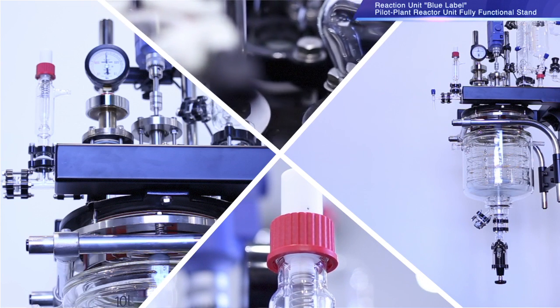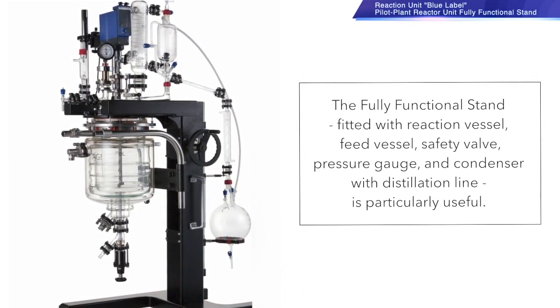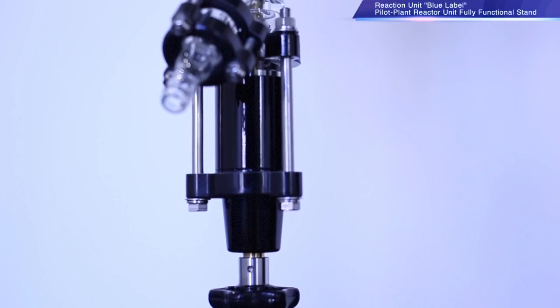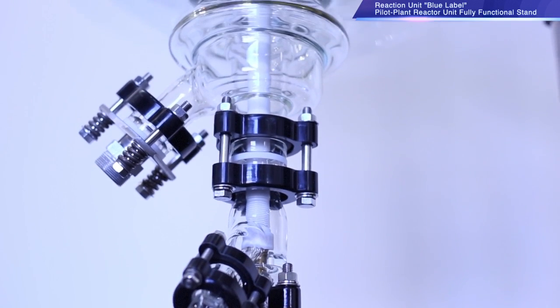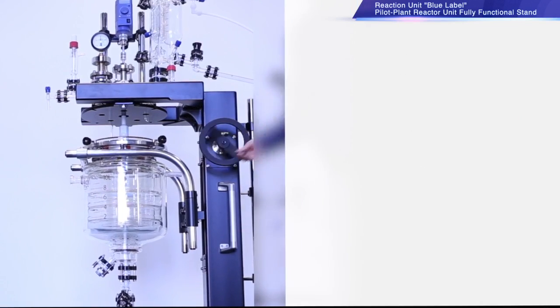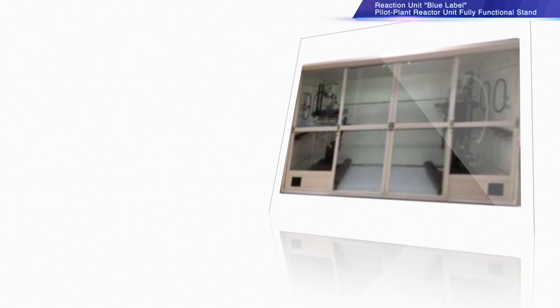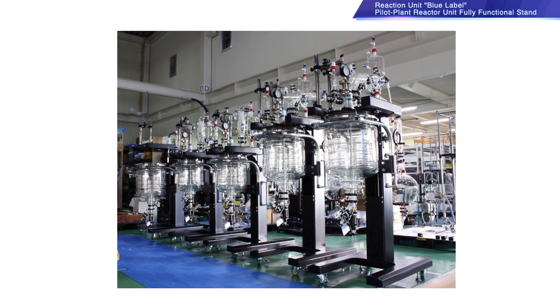This is the Blue Label Pilot Plant Reactor Unit with fully functional stand. 10 litre plus capacity units are fitted into an easily moveable, wheel-installed stand. The fully functional stand is fitted with a reaction vessel, feed vessel, safety valve, pressure gauge, and condenser with distillation line. Raising and lowering using the pulley handle allows for easy cleaning and removal or replacement of the stirrer. The compact footprint of the unit allows for simple insertion into a fume hood.